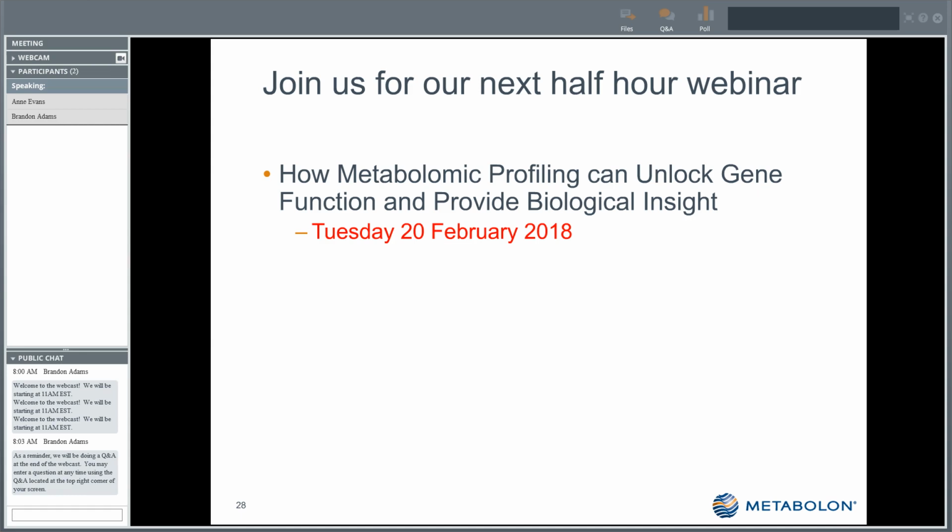Now, where it can be tricky is, let's just say in a particular study, you only see 2 of the 4 peaks that you might expect. And in that case, you're going to be relying on historic precedents of which are the more common ones, which are the less common ones. In some cases, if we are not completely confident that we are making the right identification, we will actually not report that compound. Again, we are fairly conservative in that we want to make sure that when we identify a compound, we make it correct. So hopefully that got some of that question.